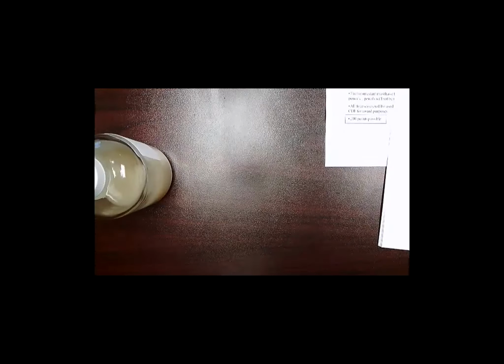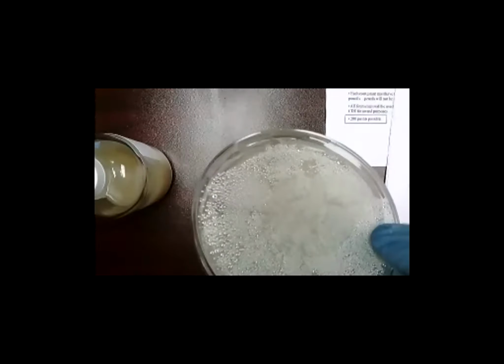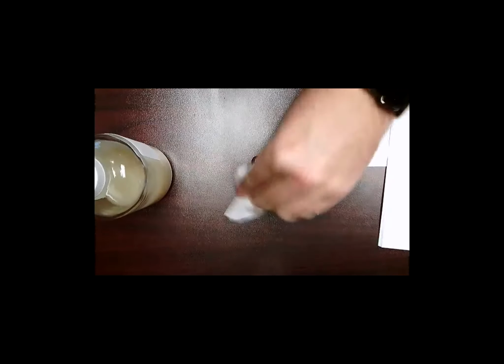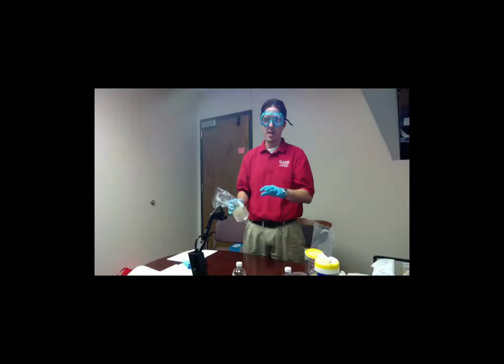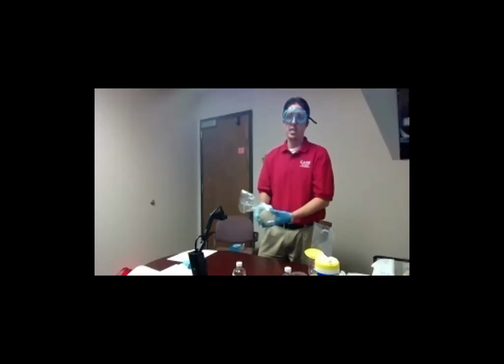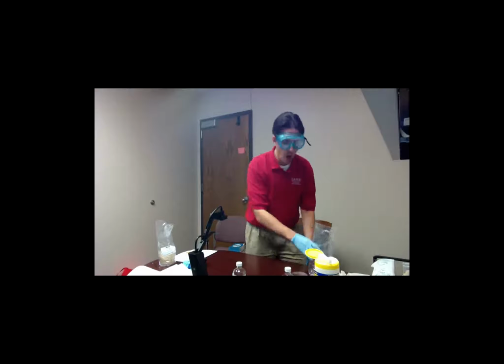I would recommend, if you have the funds, when you are working with your class and working with your team, to go ahead and, we have one leaking, to go ahead and order the pre-made ones, because if kept properly in the refrigerator, these will last about 6 weeks, I believe. The exact dates, if I'm incorrect, are in the guidelines. And the company Carolina ensures that they are ready to use and they will be effective. So any questions about making the agar if you're going to do it that way?